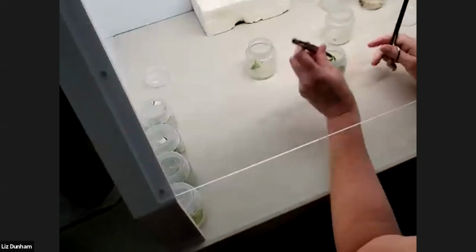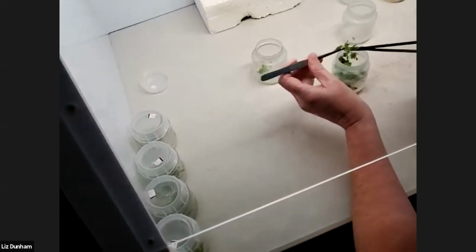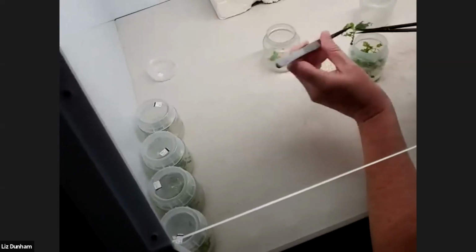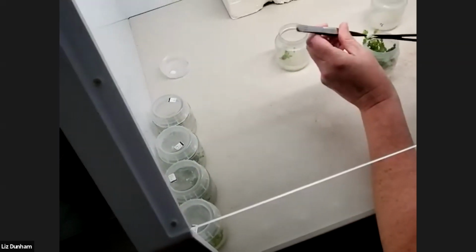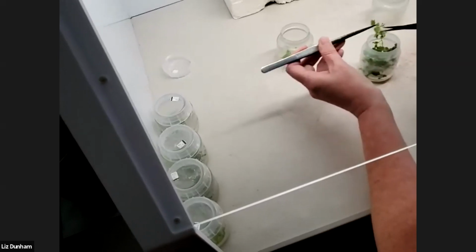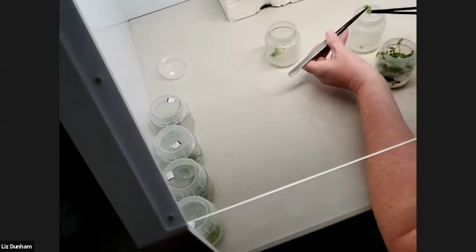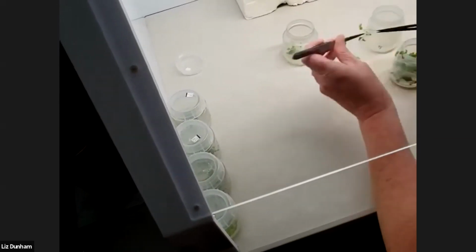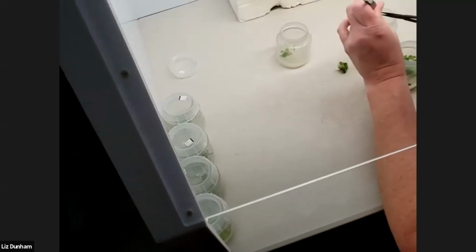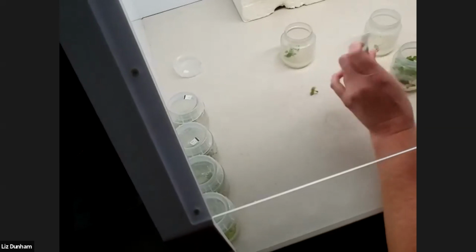And these are pretty hefty plants, so they should be a good teaching tool for this. And she is using her scissors and her tweezers. We don't use the knives, the scalpels or anything. We don't put anything down. This is the mode that we've developed, and we find it to be quite effective.